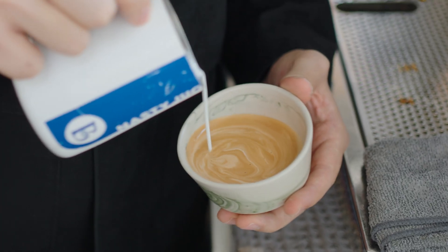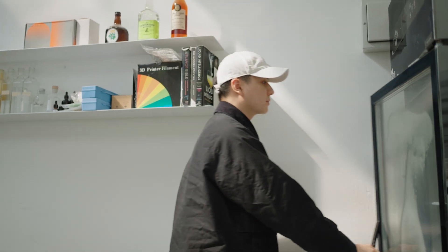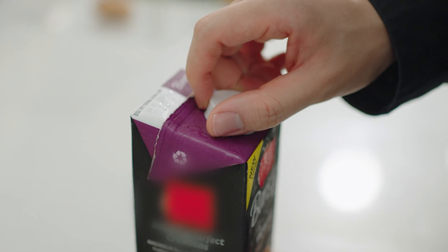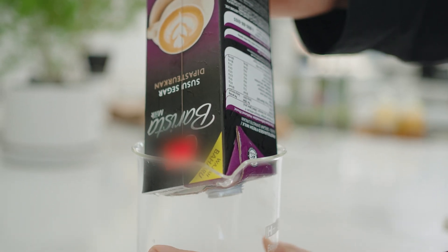In the barista world, distilled milk is not a new thing. It was made famous in the World Barista Championship years ago. The conventional way of preparing the milk is to freeze the milk overnight in the freezer — usually a day, depending on the amount of milk being frozen. Once the milk is frozen, it is removed from the freezer and placed upside down to melt. Protein, fat, and sugar will melt first, leaving the water behind, thus creating a thicker milk.